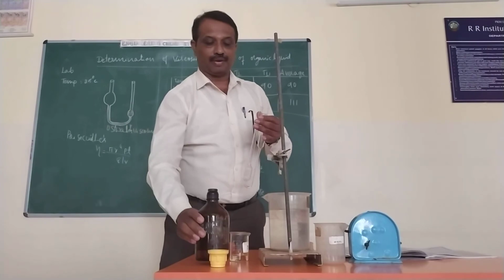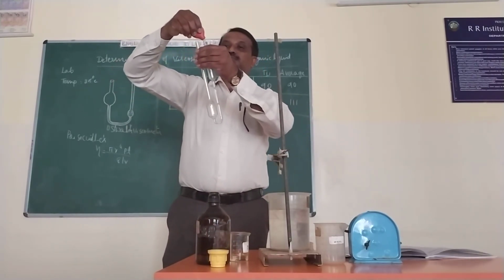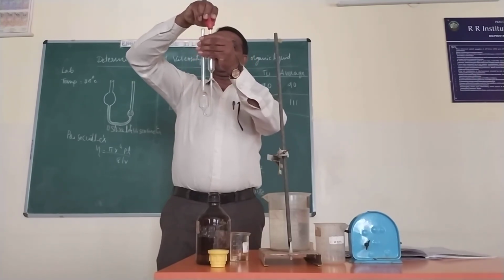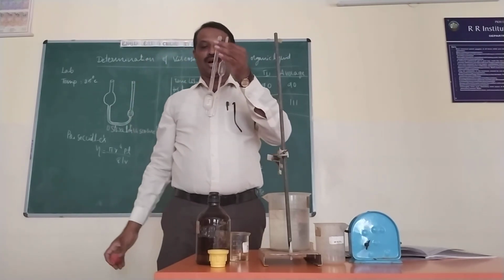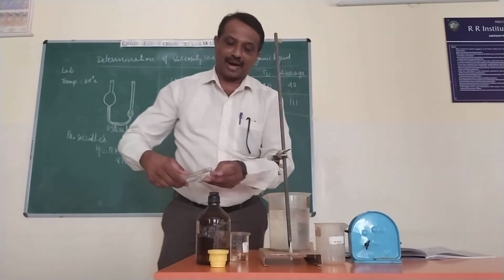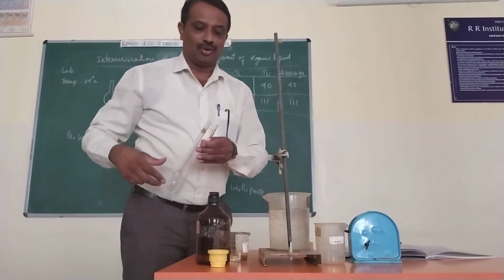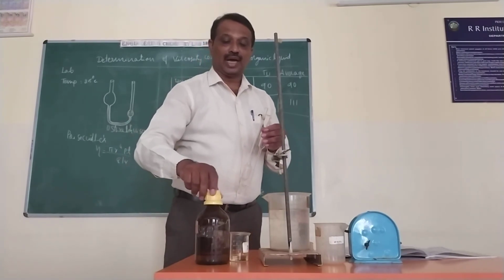Afterwards transfer it from the larger bulb to the smaller one using the same rubber bulb. Don't suck it. Afterwards pour it back into the acetone bottle. Don't waste the acetone, and don't throw away organic solvents.